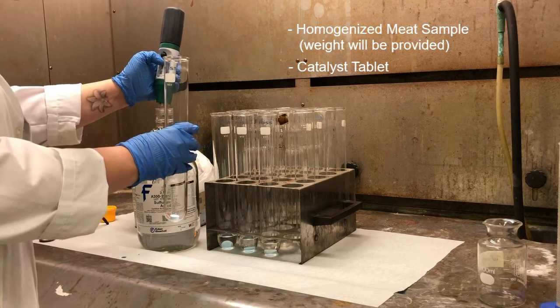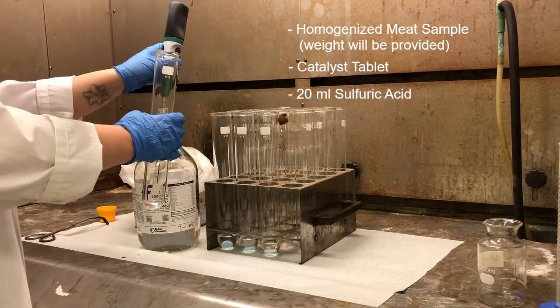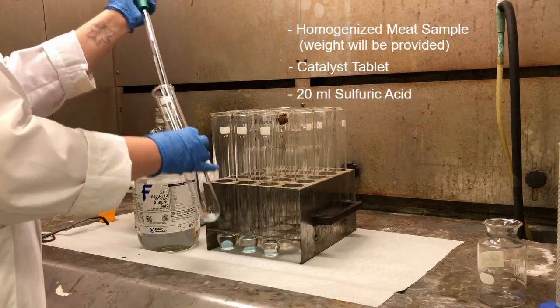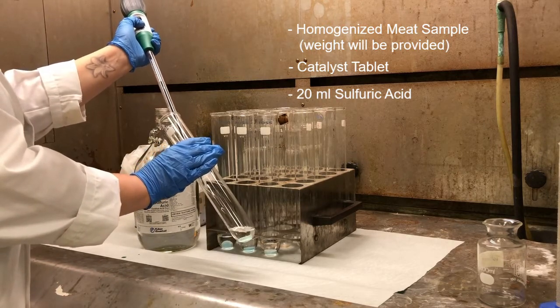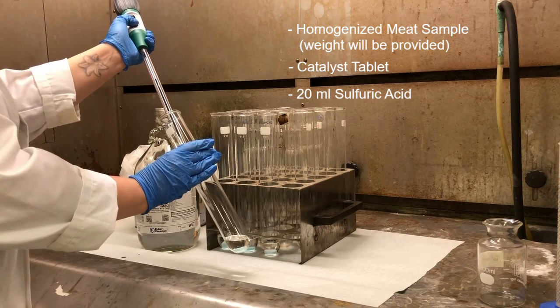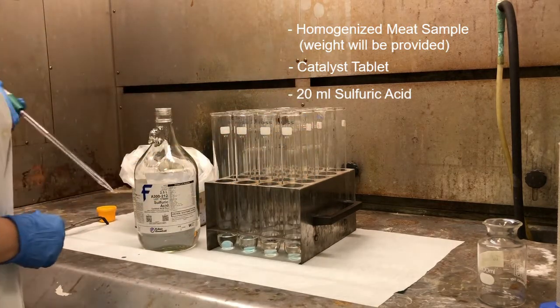This is concentrated sulfuric acid, which is why I'm wearing gloves and doing this in a fume hood. Anytime you're dealing with corrosive acids, you want to be very careful. I'm pouring it down the side of the tube. Okay, so that's ready to go. Now we will take them over to the digestion block and get that running.